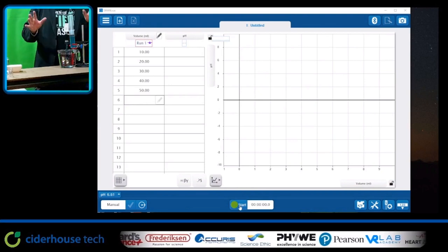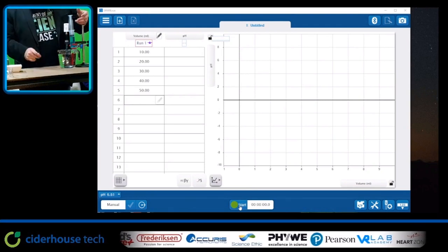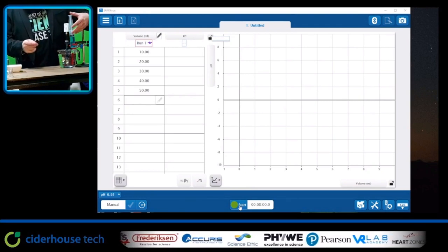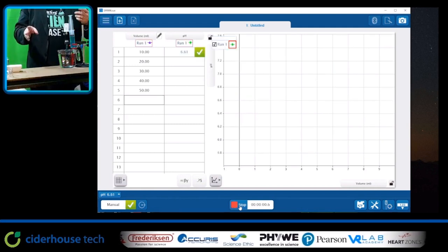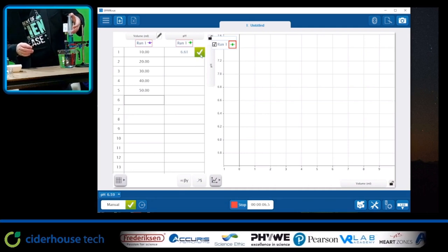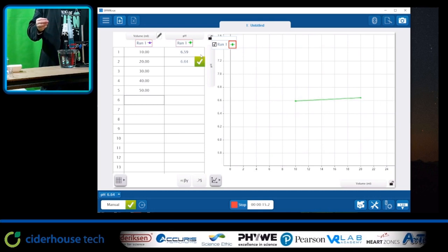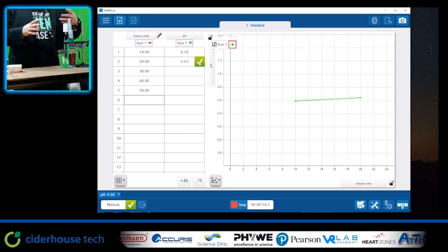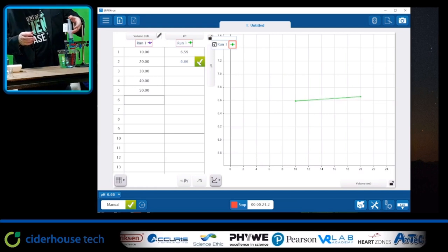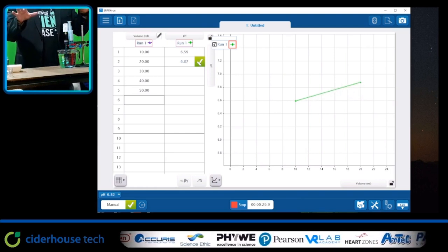Okay, so now we're ready to do the prac. I've just set this up here and it's got 50 mils in, as we just set up. What I'm going to do now is press start on my software, and I'm just going to add 10 mils to our liquid here. Now I'm going to press pause and get ready. Now again, I'm going to add another 10 mils. Press the tick button again.